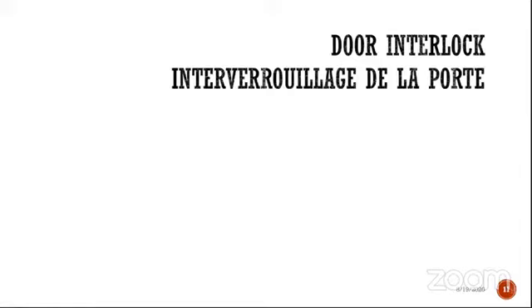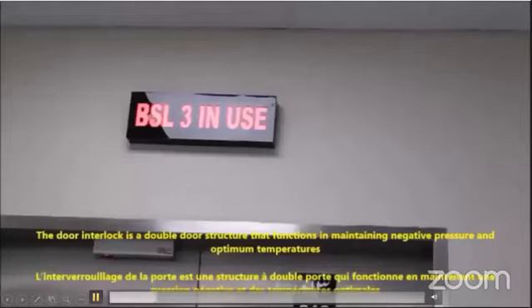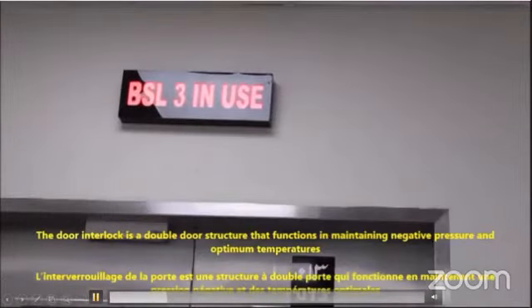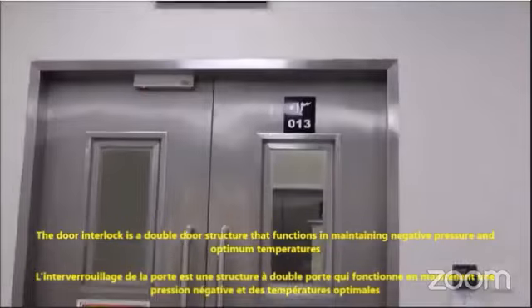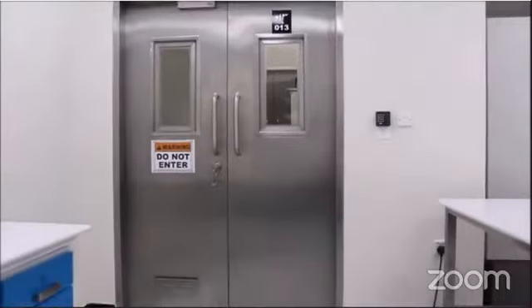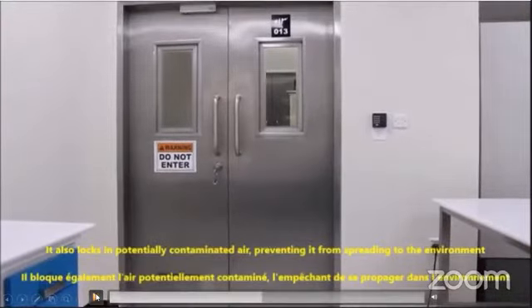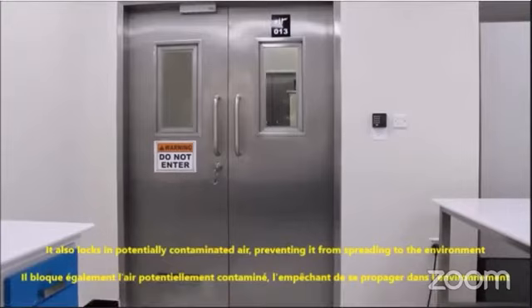Another component is the door interlock. The door interlock is a double door structure that functions in maintaining negative pressure. It potentially locks up contaminated air and prevents it from spreading to the outside environment.